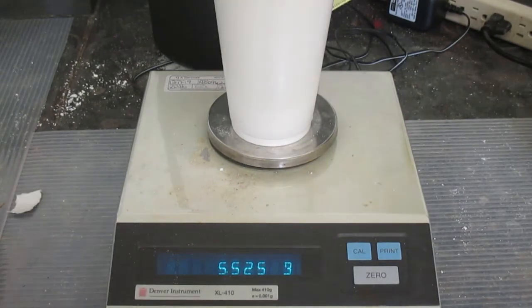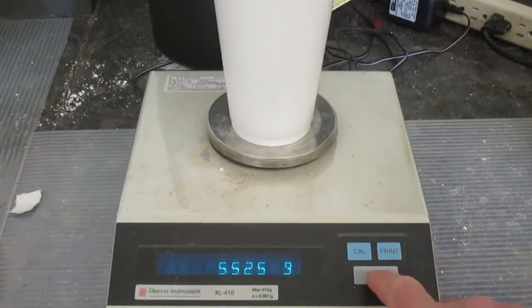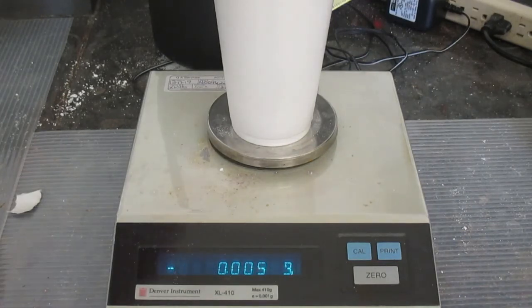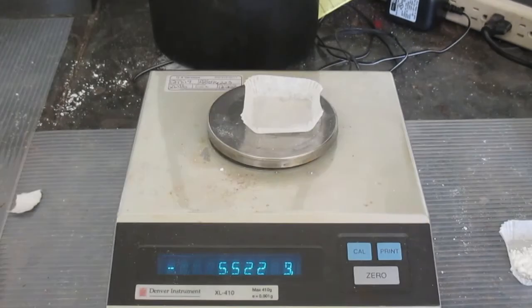So we need to record the mass of the hydrochloric acid. We have, once again, a styrofoam cup. We're going to zero the styrofoam cup, and we're going to record the mass of the 25 milliliters of HCl that I just added to the styrofoam cup. The mass now of the HCl solution is 24.890 grams.